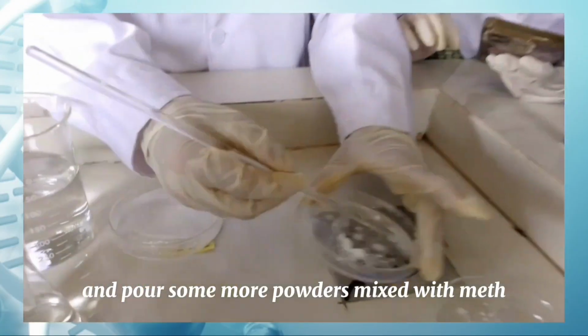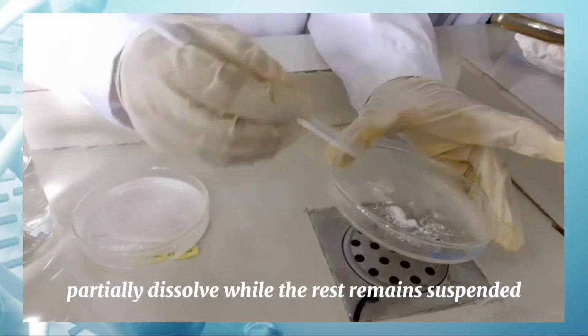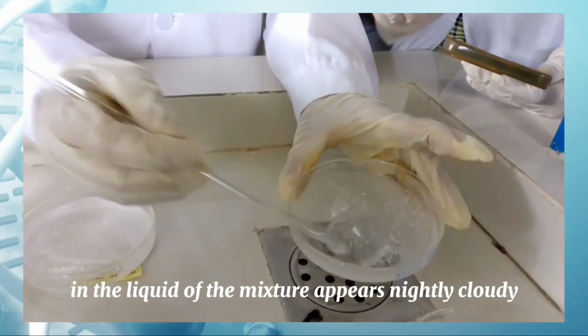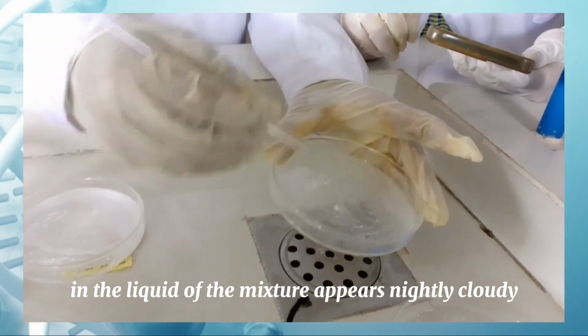When paracetamol powder is mixed with methanol, some of the powder partially dissolves, while the rest remains suspended in the liquid. The mixture appears slightly cloudy.